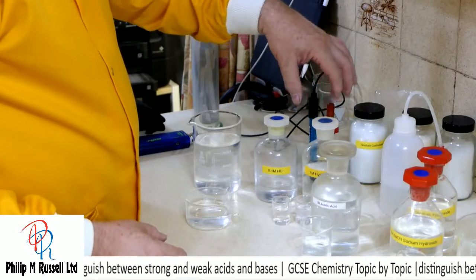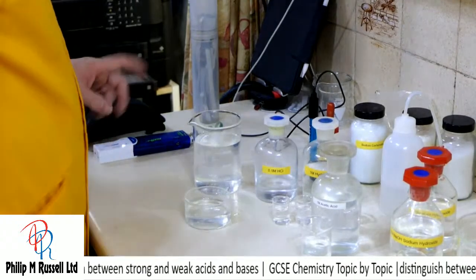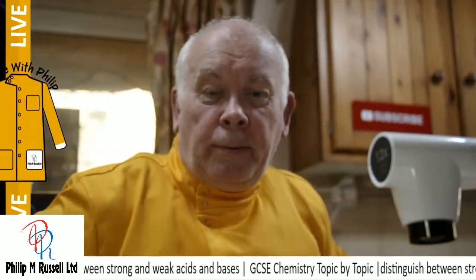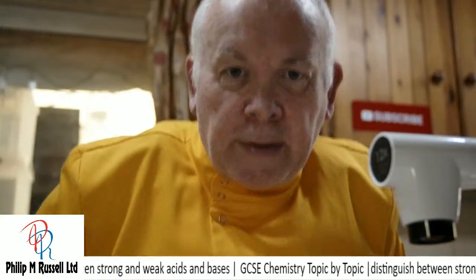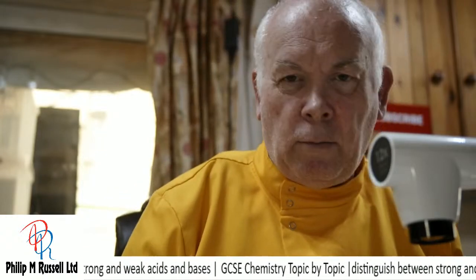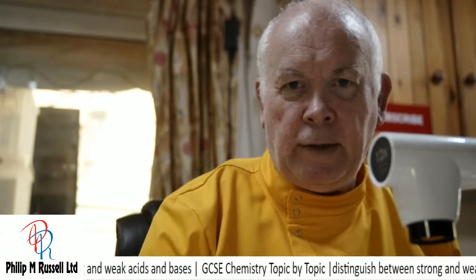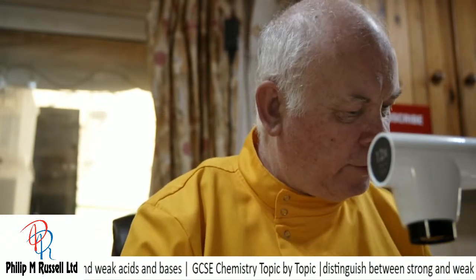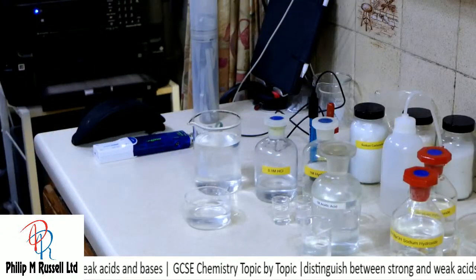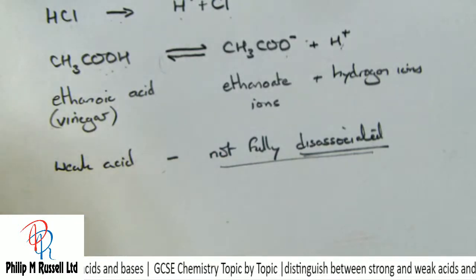The pH probe does need to be calibrated every now and again, and what we do with that is I put other solutions. So I've just taken the safety specs off, and what we can do is try this in different sort of what we call buffers. So before I start, we eventually got the right screen there.